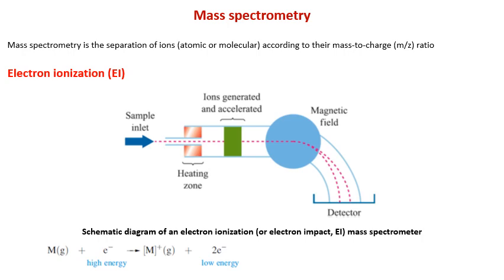So the output from the mass spectrometer, a mass spectrum, is normally a plot of signal intensity against mass to charge ratio. So what is the ultimate fate when you detect the mass spectrum? It is plotted as signal intensity versus m/z ratio. I will show you the experimental mass spectrum in a couple of slides.